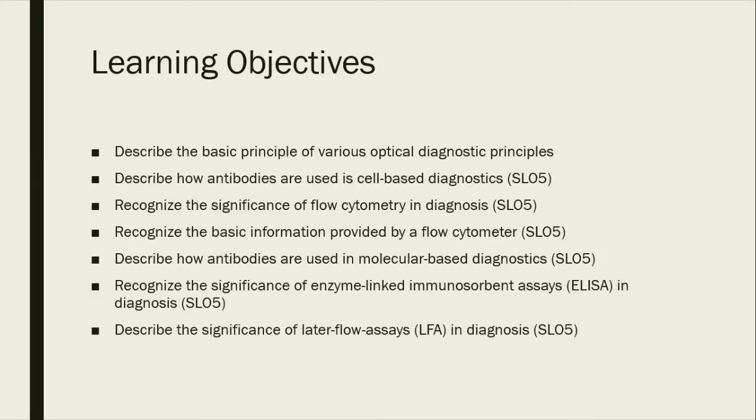Alright, so some of the learning objectives, we will be looking at some basic principles of various optical diagnostic techniques, okay, or principles. It's a little bit redundant word here. So we'll look at some of the fluorescent principles. Some of you pointed out having a fluorescent probe in the PCR kit that you look at, and as a reporter, how it generates a signal. And someone also mentioned a quencher, something that quenches the fluorescence signal. So I figure it is a good idea to fill a little bit of gap in your reading. So that's one thing I want to point out.